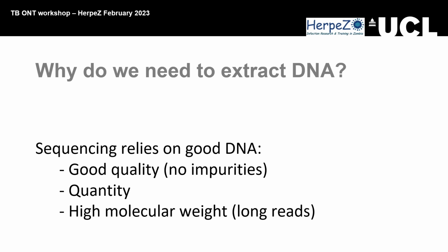Then for high molecular weight, we need long reads. So we're going to be as gentle as we can so that we get long strands of DNA, because we don't want short strands. When sequencing, we need longer strands.